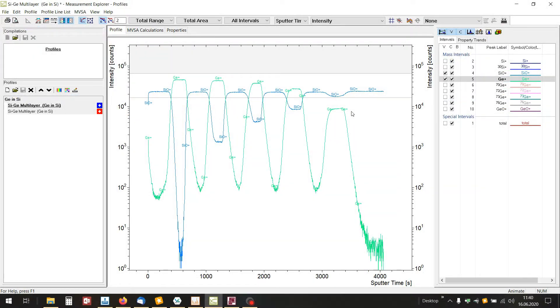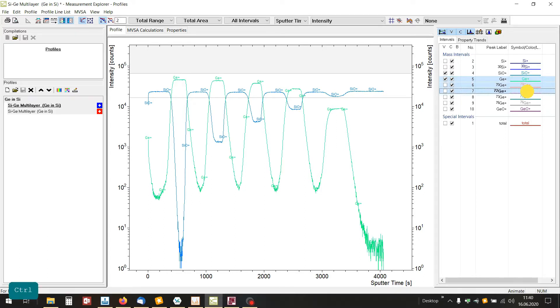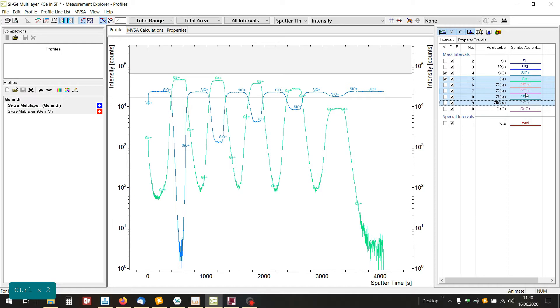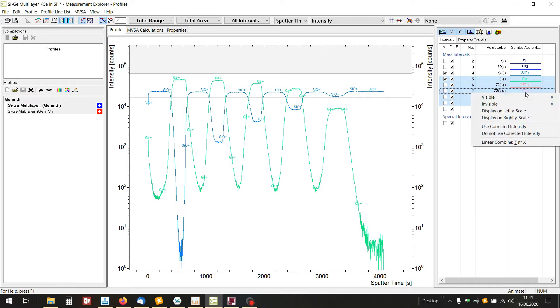You can do arithmetic on profile lines like multiplication or division or a simple linear combination. Select the profile lines and open the context menu with the right mouse click.